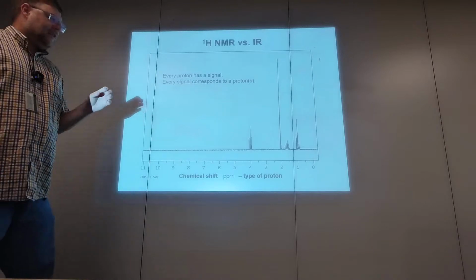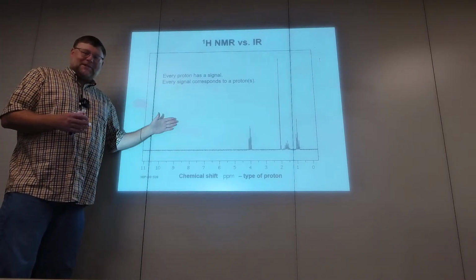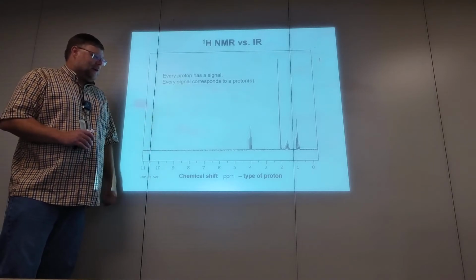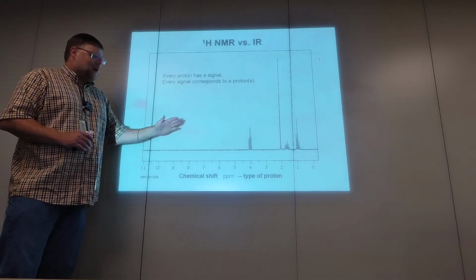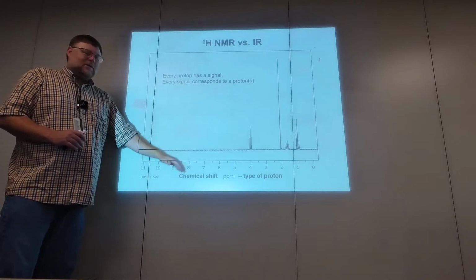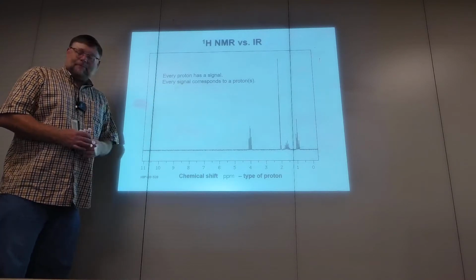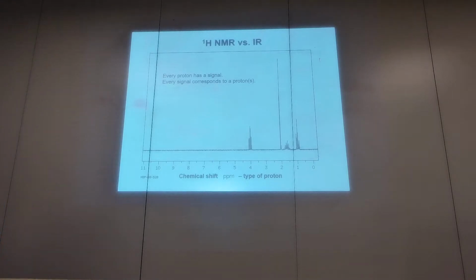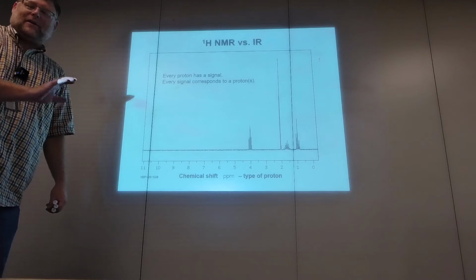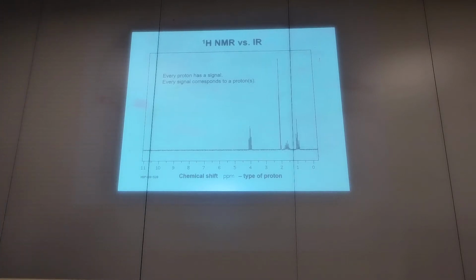Probably not, right? At this point, probably you haven't done a lot of proton NMR, and so you probably don't have the information or experience to deduce the molecule to fit this spectrum. So let me give you the molecule. If you want to hit pause and give it a try, feel free, but my guess is you're not going to be able to do it.